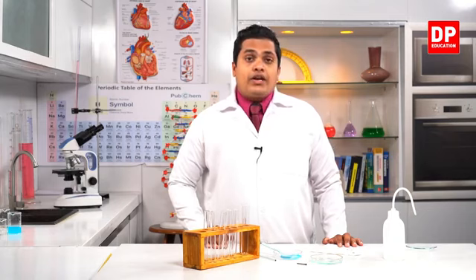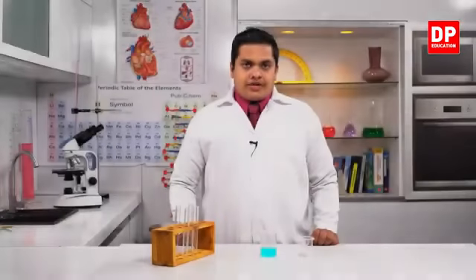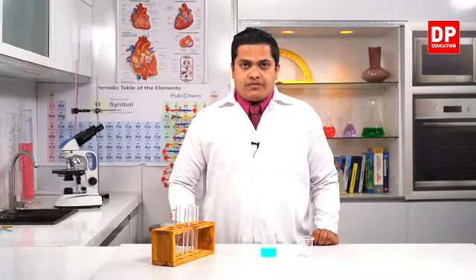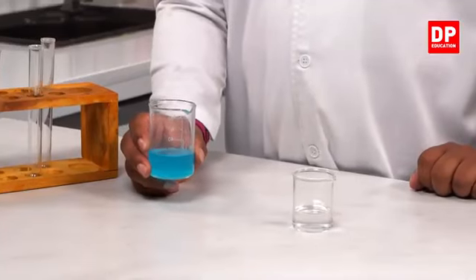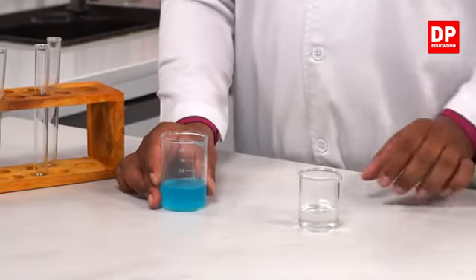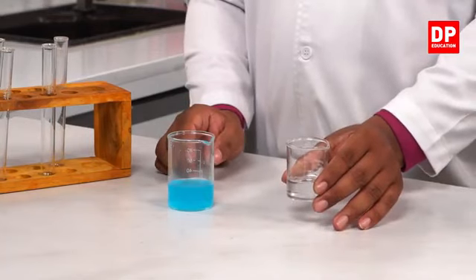Right. So we'll continue with our lesson once again. Right, my dear children. Now let's see this experiment where we are going to mix some amount of copper sulfate solution with sodium hydroxide solution. Right.